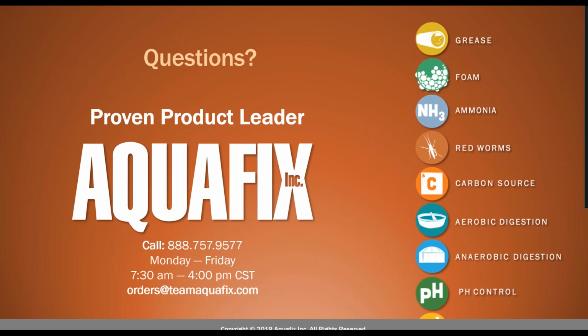Here, if I send a mixed liquor sample for analysis, what is the hold time for shipping before the floc and the sample begins to change, like oxygen levels? So we actually recommend to ship samples on ice, and typically it's 2-day shipping that we provide. So when the mixed liquor samples are placed on ice and shipped 2 days, we end up looking at the sample right away then, and with the mixed liquor being on ice, the sample really should not change much at all over those 2 days. It's a different story if samples are shipped warm, but that's why we recommend shipping on ice to preserve the sample before our analysis.